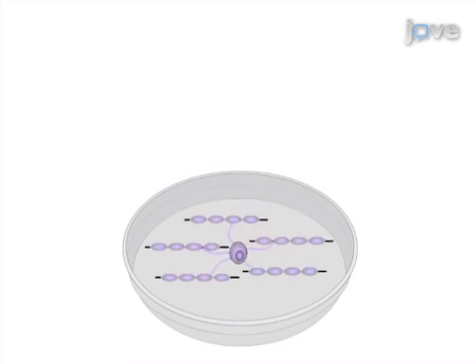Ultimately, the myelinating co-cultures are assessed for myelin protein expression by Western blot analysis and visualized for the formation of myelinated axonal segments by immunostaining.